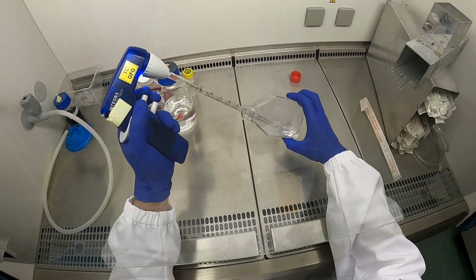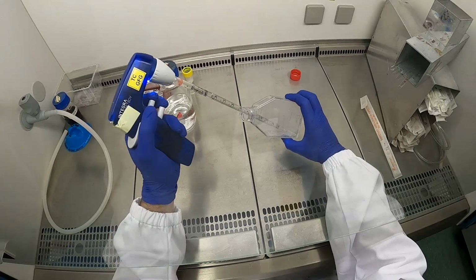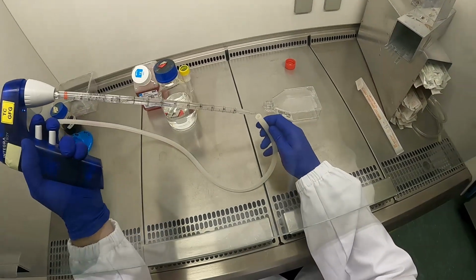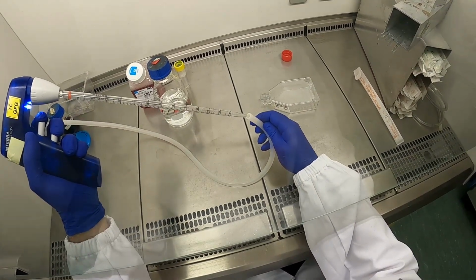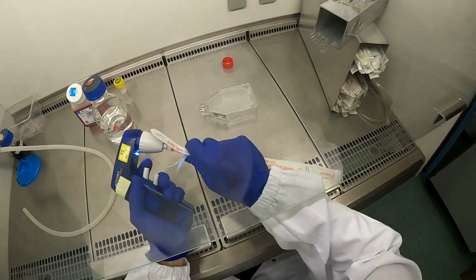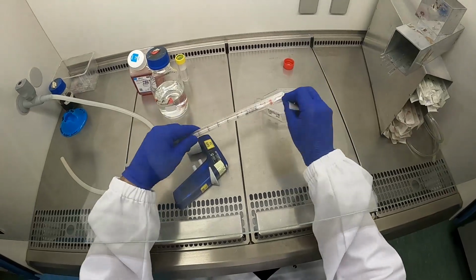I then aspirate, take the volume we put on off again, and using the flask again, we easily get rid of it like that. Throw away the pipette, take a new one, and you know what to do.